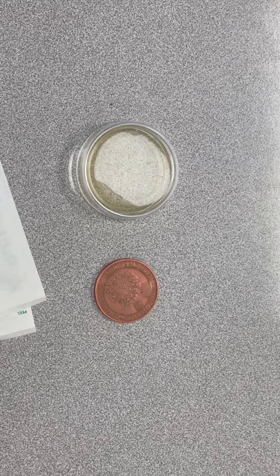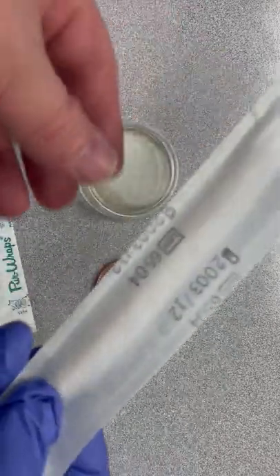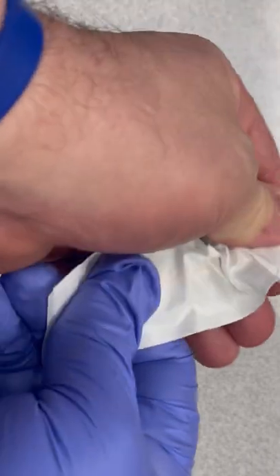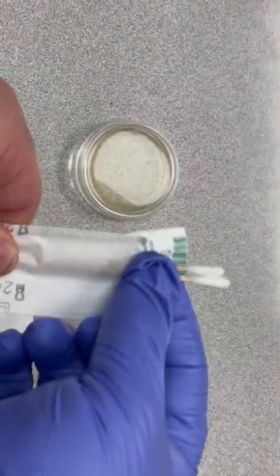Okay, we coughed on it. Now we're gonna do the experiment. We're gonna take a sterile swab — I've got gloves on for this — and we only need one swab.